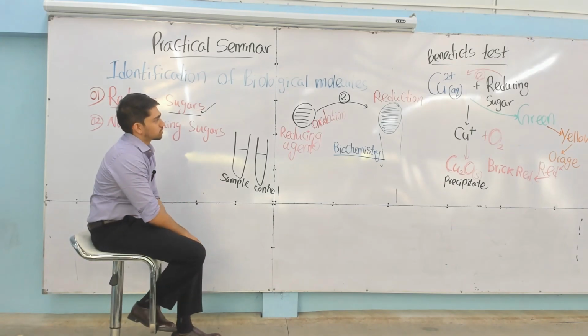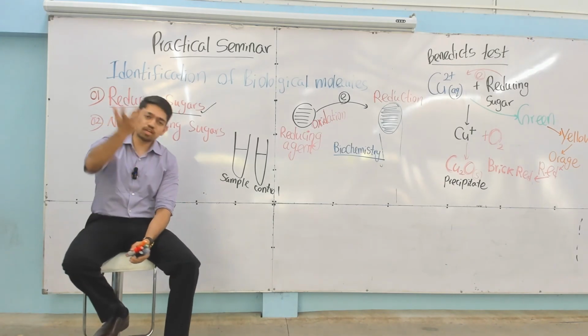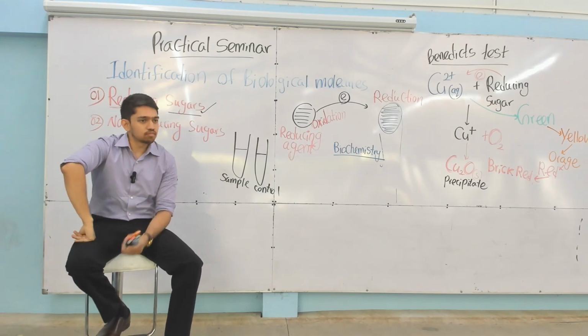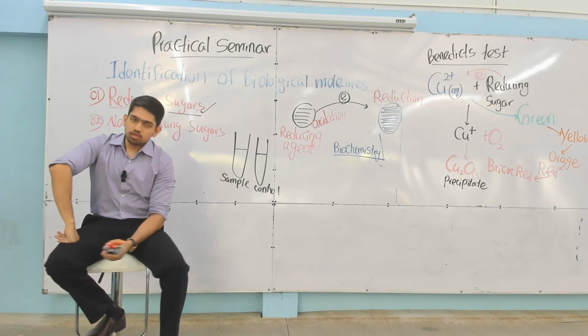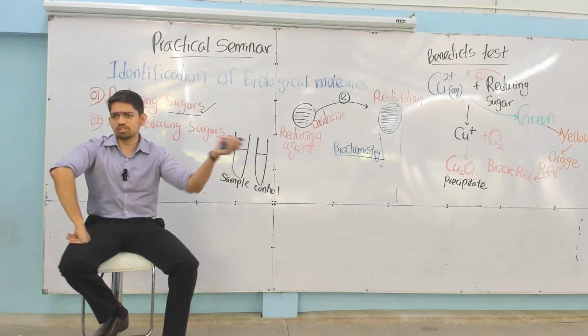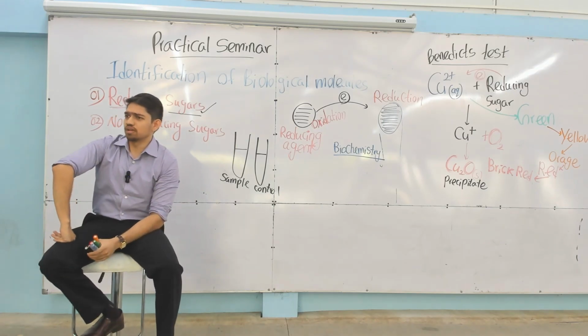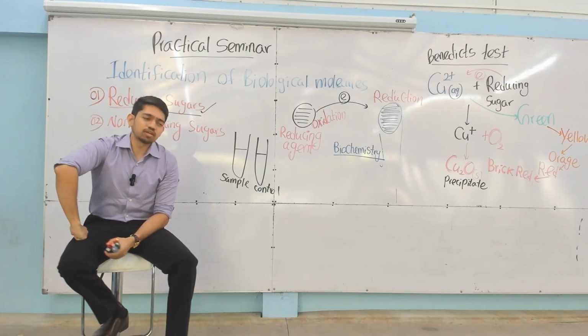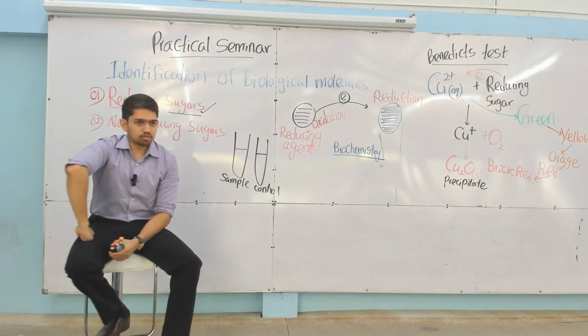Why does a person with diabetes have a lot of glucose in the urine? In their blood they have an excessive amount of glucose, so that's going to come out filtered from the kidneys. So from people with diabetes, you can get so many urine samples from our teaching hospital. In the morning, the bed pans, catheter bags and urine bags are collected and brought. Okay, patient's urine.